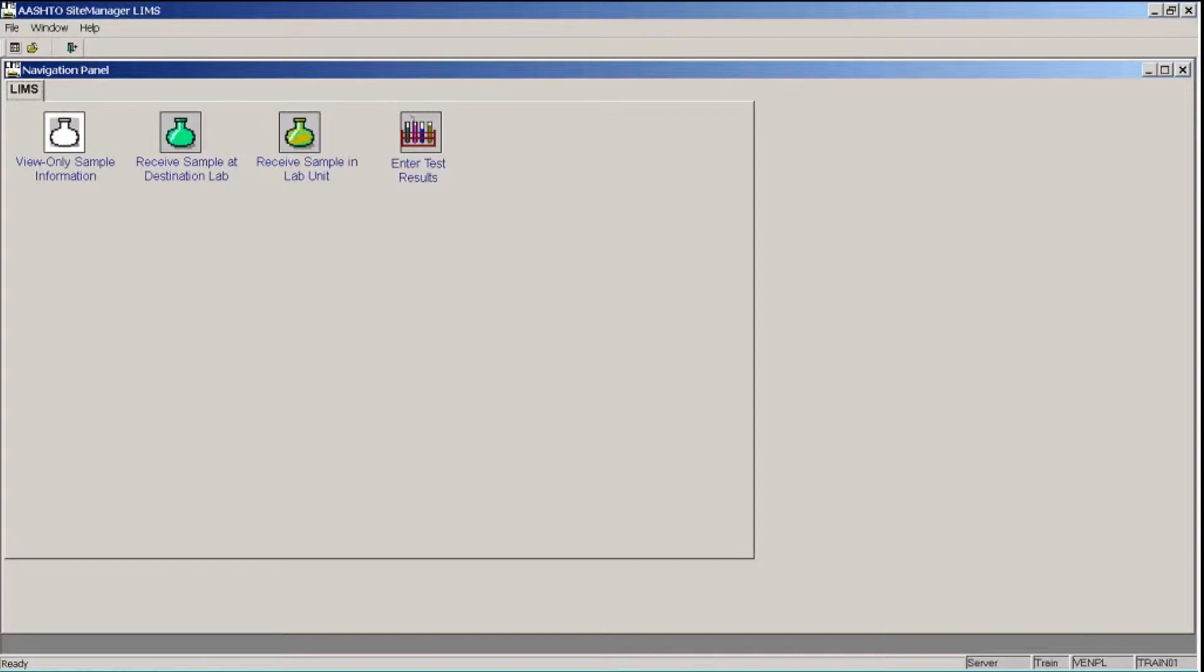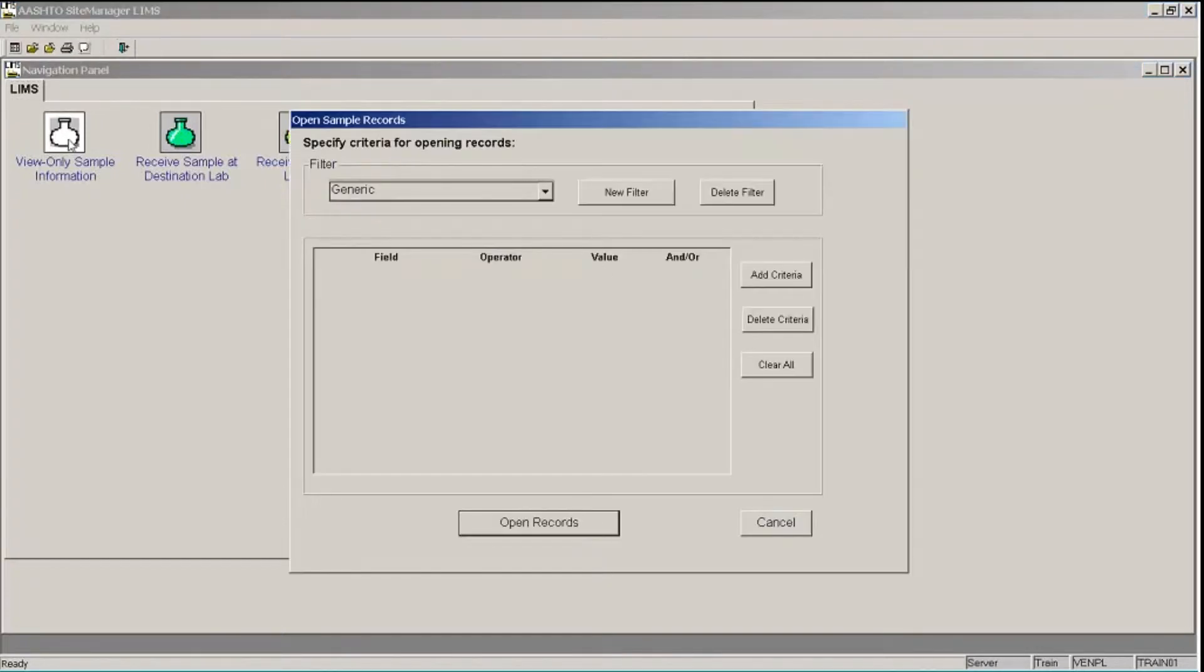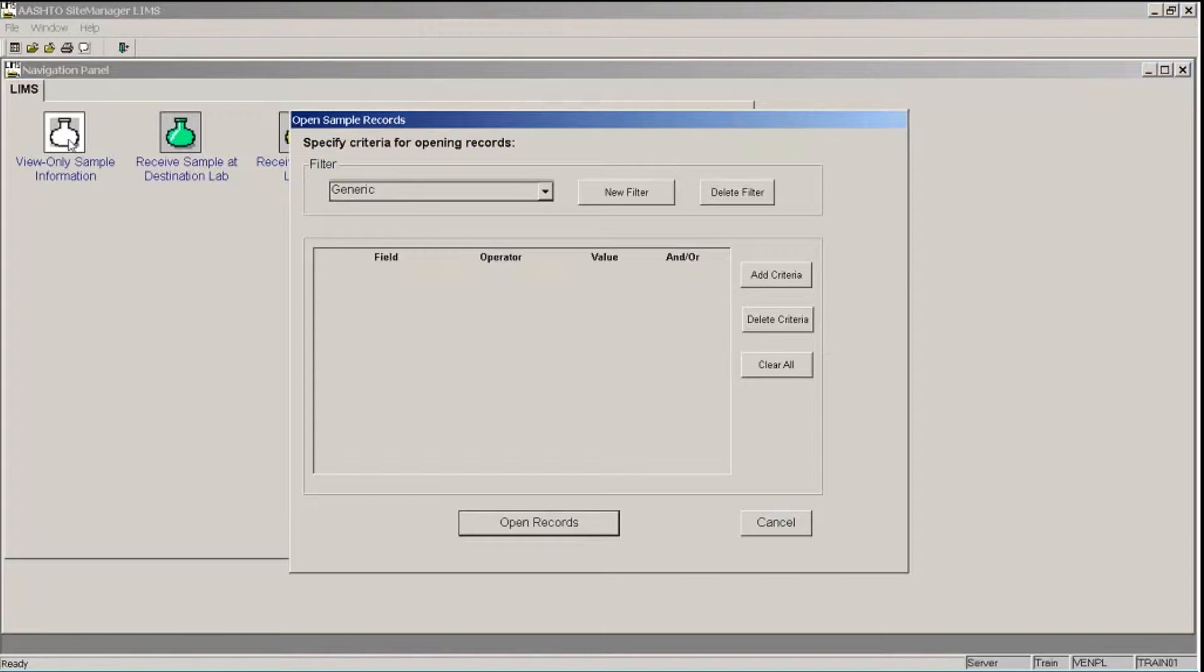Site Manager enables you to review information about a sample record from within the LIMS component. Let's double-click the View Only Sample Information icon. This brings us into the Open Sample Records dialog box, where we can specify criteria for the sample or samples that we want to view.